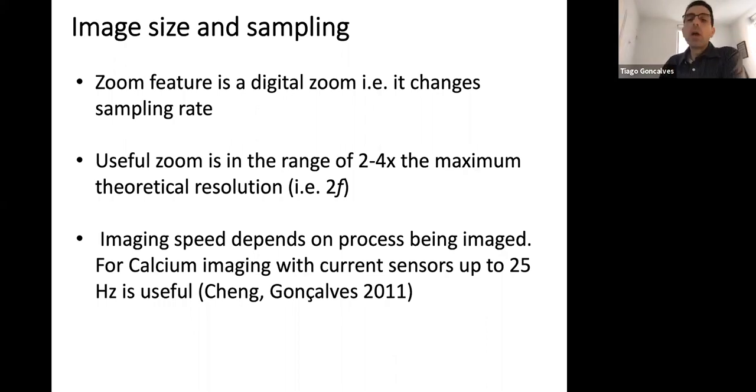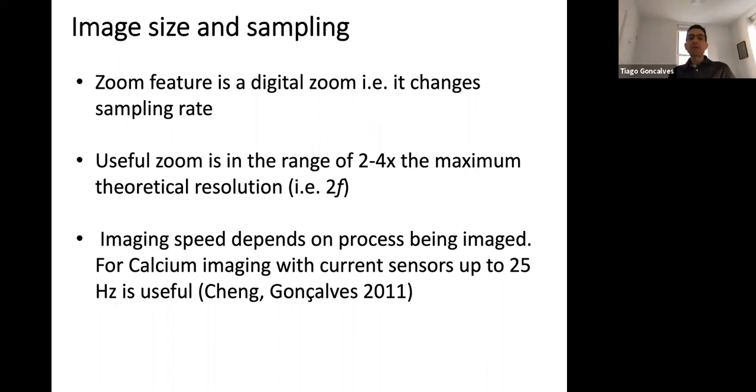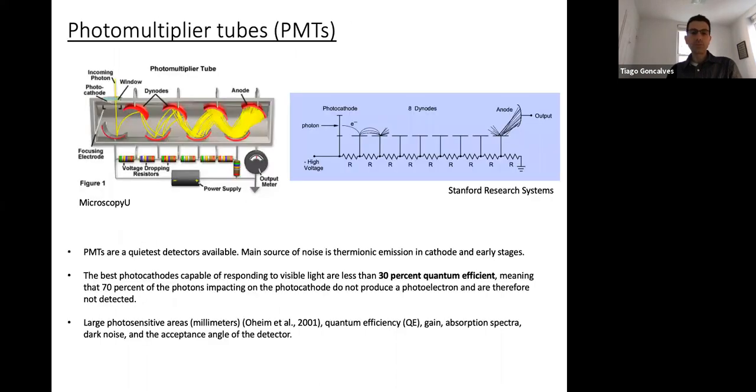Right. But this is assuming the calcium sensor is perfectly fine. That is true. But actually here, what you start seeing is the opposite: if you only have a single action potential, sometimes you miss it. If you have two action potentials, you always catch it. But if you have the singlet, you can miss a lot of those if you're going too slow. So, image detection.